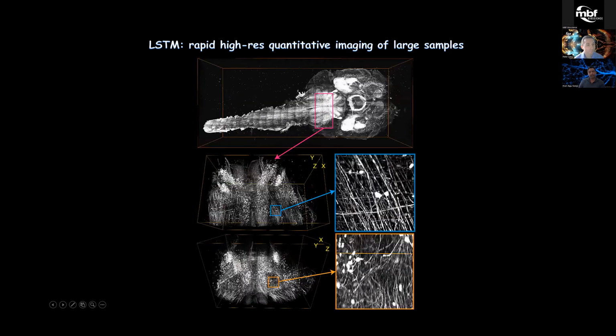All right, so with this system, we can image regular samples as well, like cleared mouse brain with attached spinal cord, as standard applications. So here's some zoom in. This is the side view. This is the Z-axis showing the axial resolution or the optical sectioning capabilities, and you can see a uniform quality throughout, right, in the center and in the periphery.